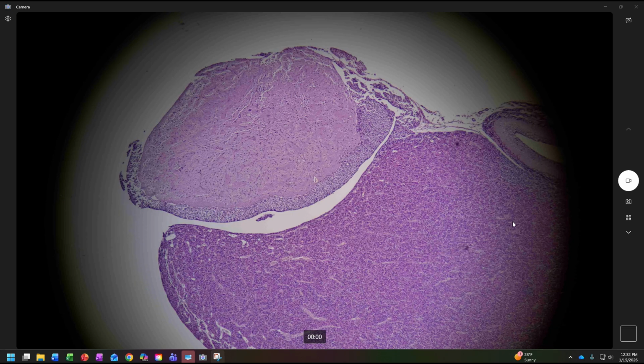Now, I can't show the entire pituitary gland on the slide because they're pretty big, even in a mouse. But we can see there are two visually distinct large regions, and there's this one over here. I think that happens to be a blood vessel, but we're really just focusing on these two.